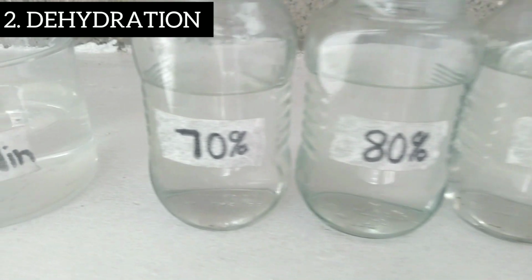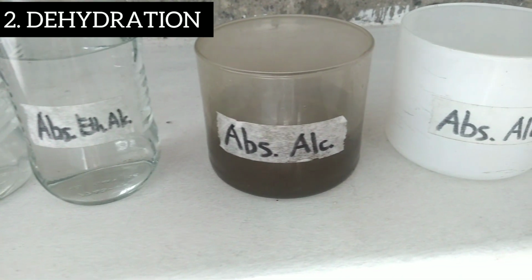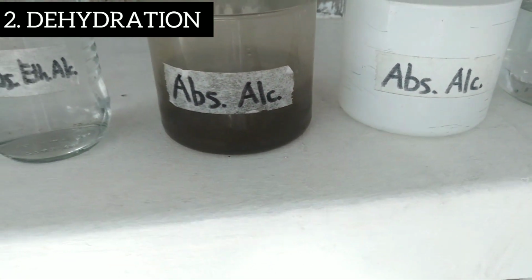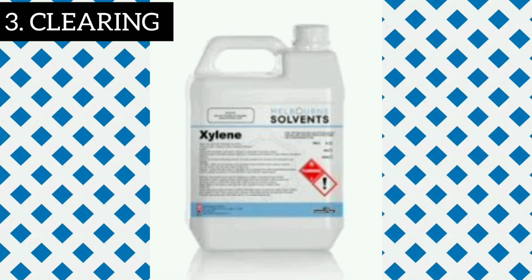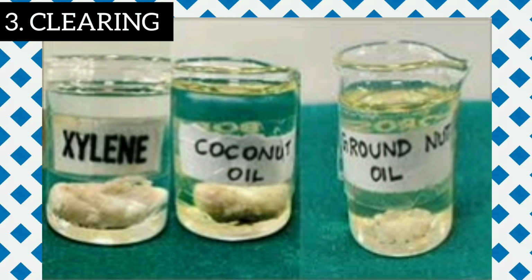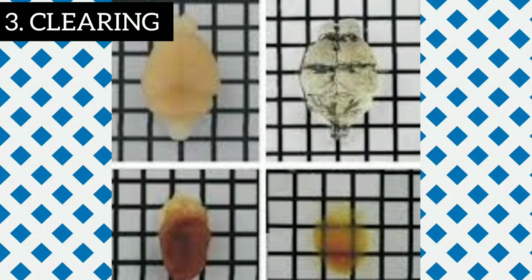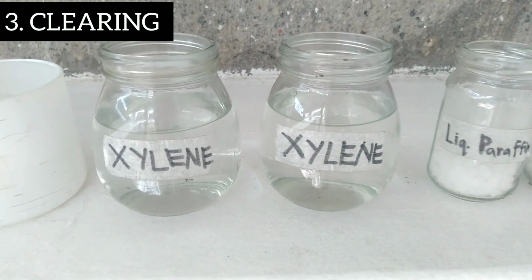When using alcohol as a dehydrating agent, it is necessary to include 2 absolute alcohol steps at the end to ensure the complete removal of water in the tissue. Next is clearing. Clearing or dealcoholization is the process of removing dehydrating agents. This process also makes the tissue transparent or clear. Clearing agents should be miscible with both alcohol and paraffin wax.